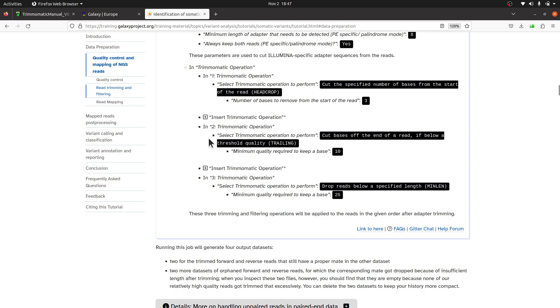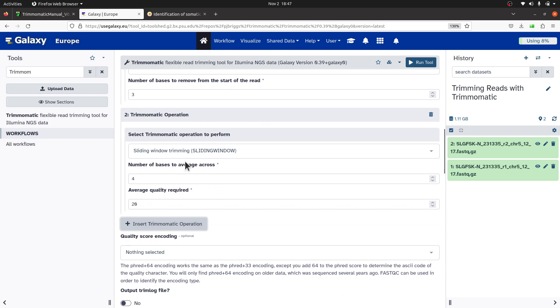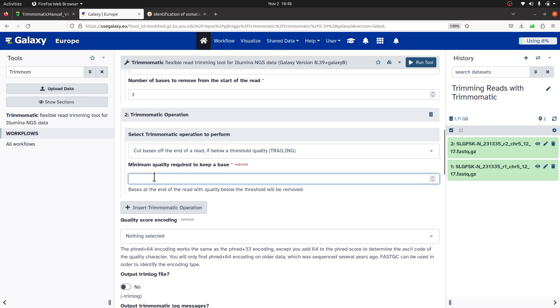We need to insert another Trimmomatic operation. Click 'Insert Trimmomatic operation' and select TRAILING — cut bases from the end of the read if below a quality threshold. Set the minimum quality value to 10.